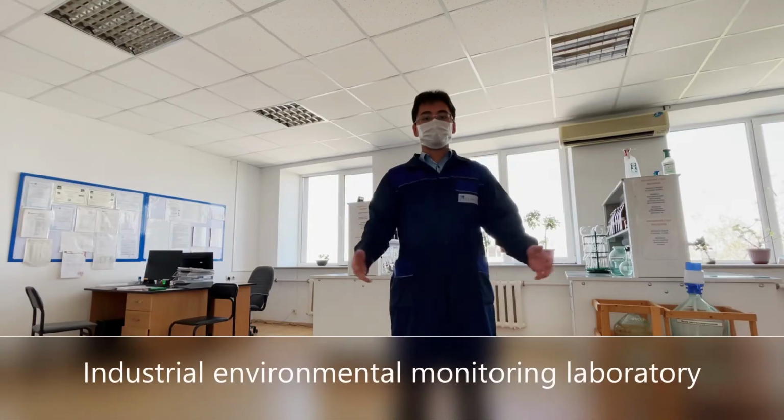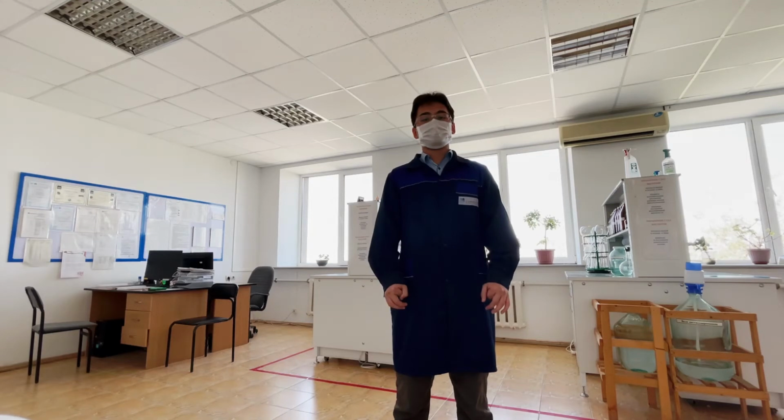Welcome to the Industrial Environmental Monitoring Laboratory. Here the scope of performed works is classified as industrial environmental monitoring, which includes the measurement of meteorological parameters, air quality control, air monitoring at sources of pollution emissions, and determination of hydrophysical and hydrochemical characteristics of surface water, groundwater and the wastewater, and selection and analysis of soil samples. And the last one is the radiation monitoring of the territory, premises, workplaces, scrap metal, measurement of radon and thoron. And the second classification is the certification of a workplace with the work conditions.